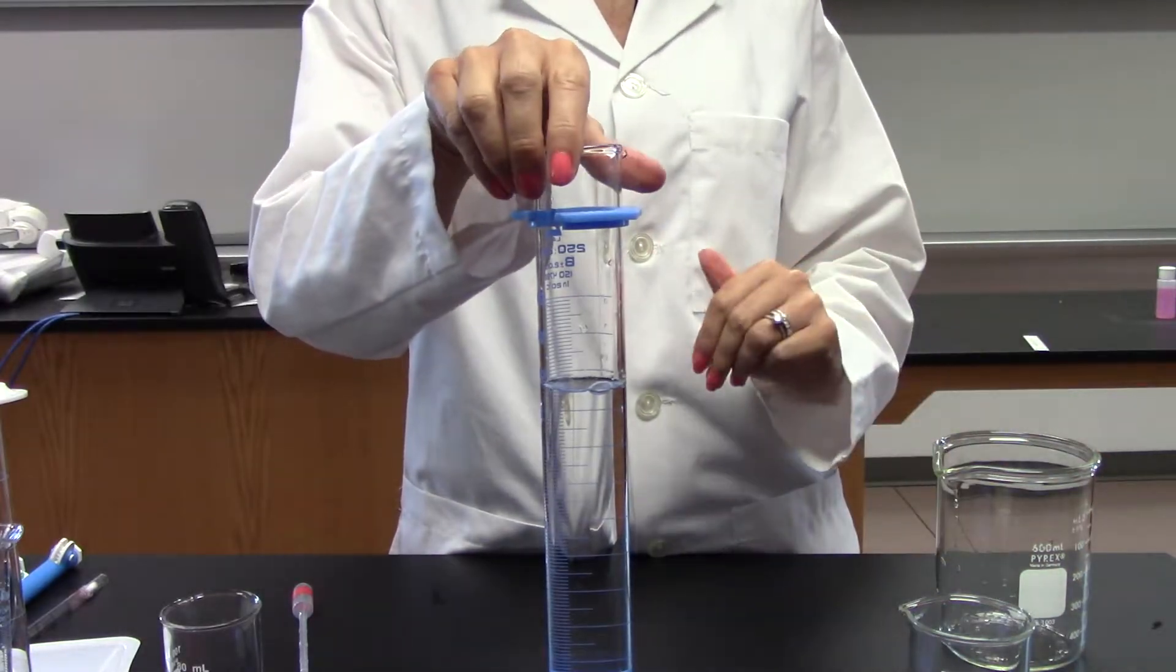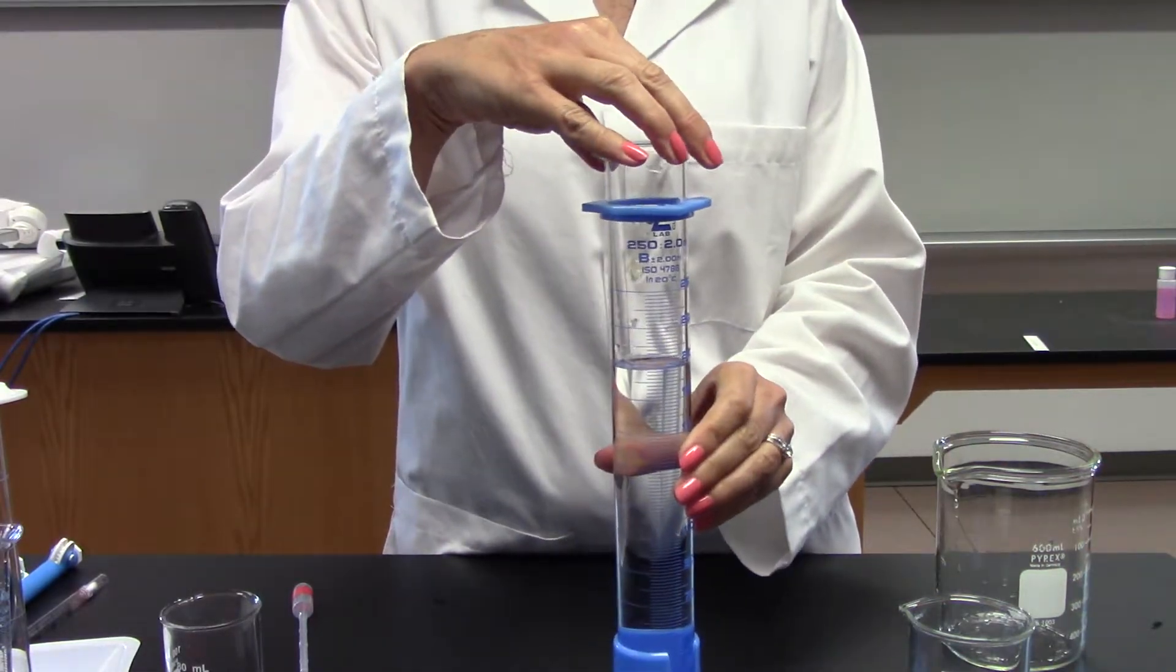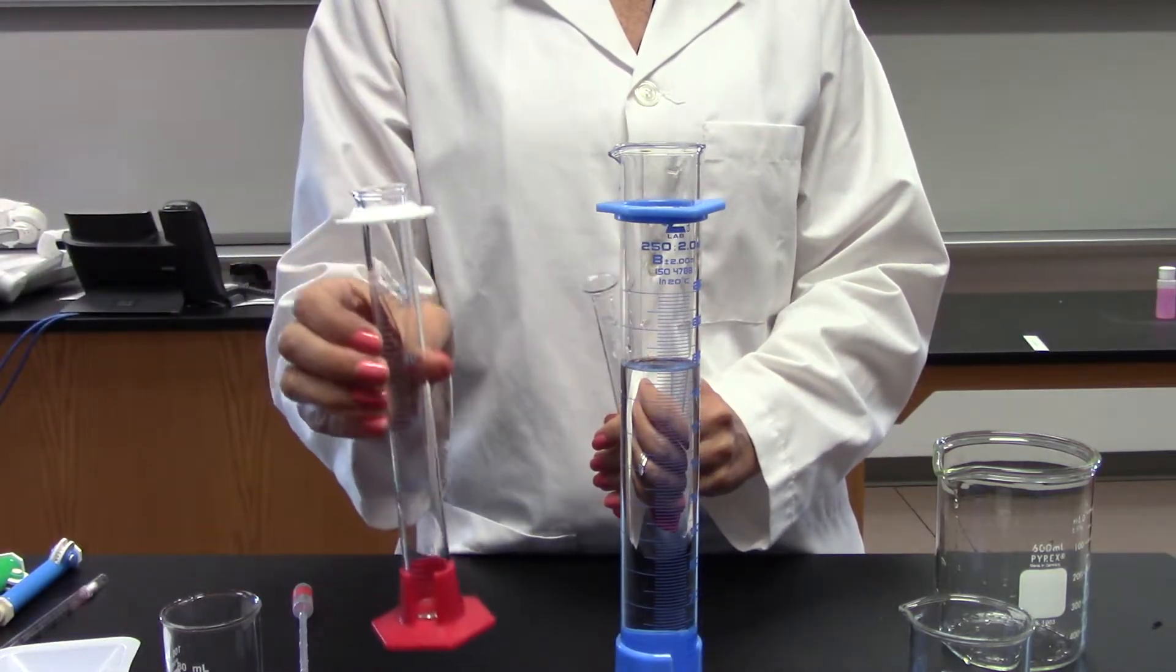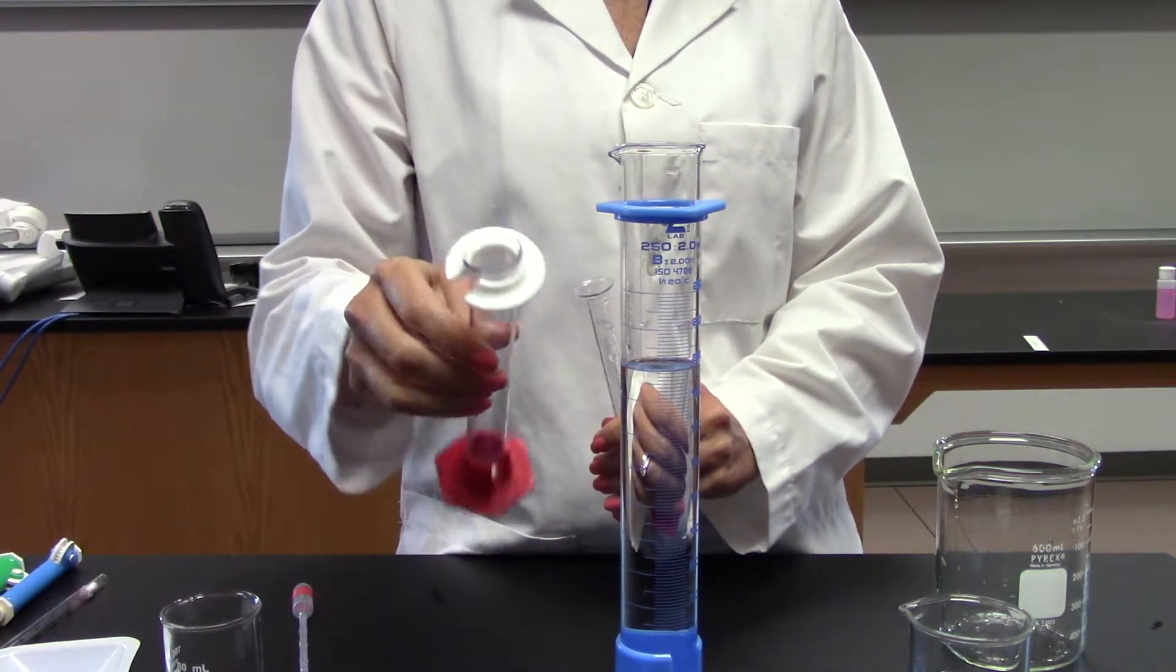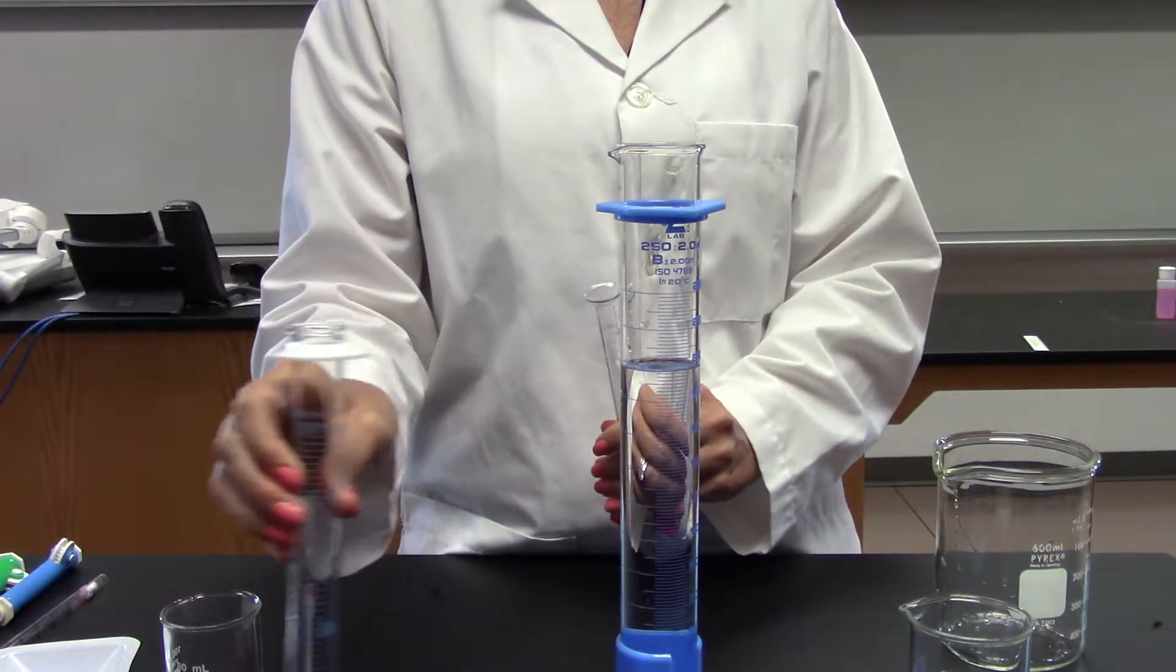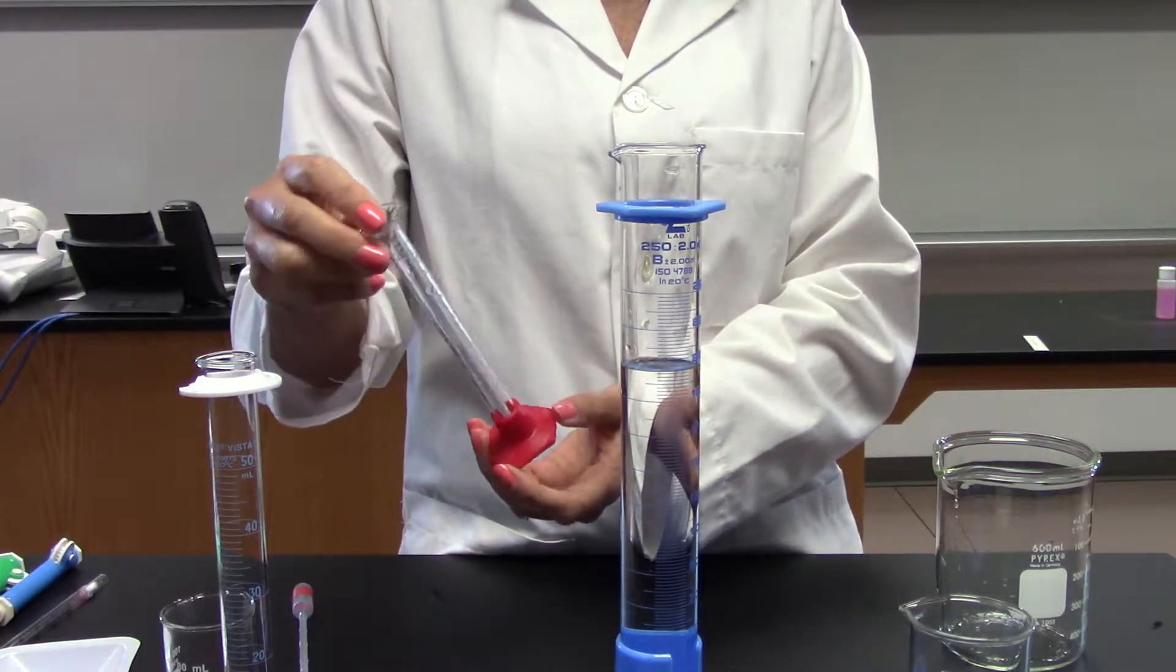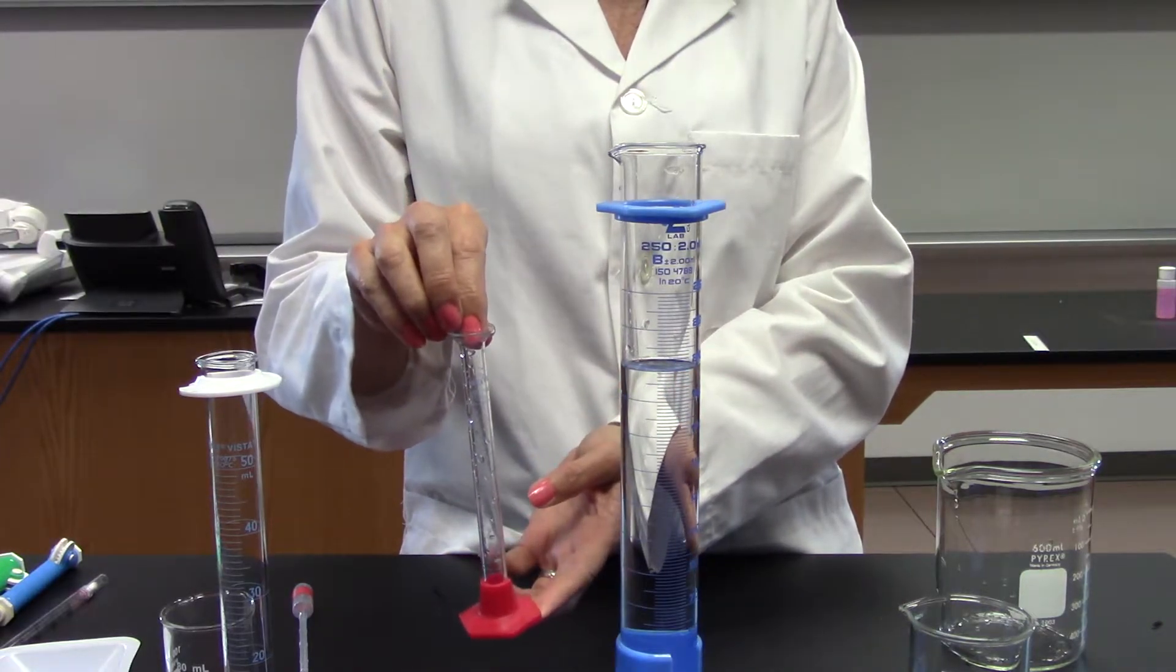Graduated cylinders are far more accurate and become more accurate the smaller the diameter. So you can see this is a 50 milliliter graduated cylinder with a smaller mouth than this one, smaller diameter. And this one is even smaller - this is a 10 milliliter graduated cylinder.